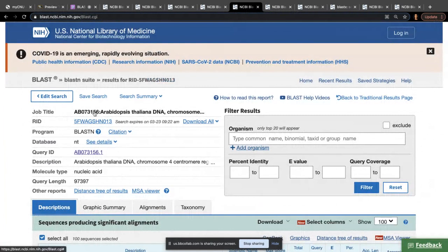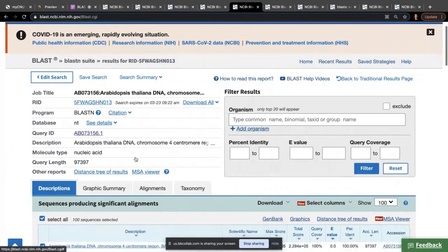And I did that. So I'm doing the BLASTN. In my first pass, I pretty much always just leave it as the default database, which is the nucleotide database, the first one in the drop-down menu. And I'm always hoping that because this is the largest database, it will match something that tells me some function.